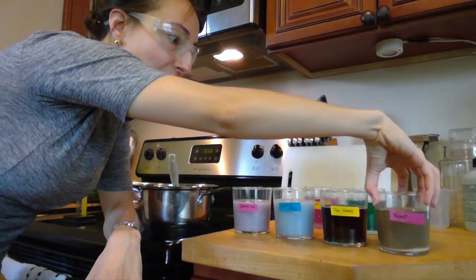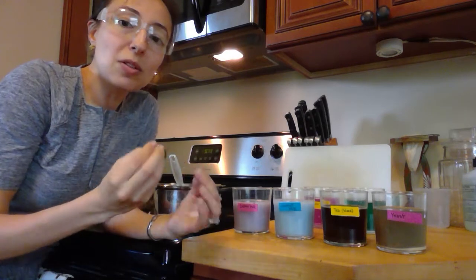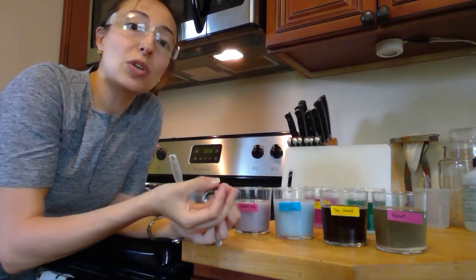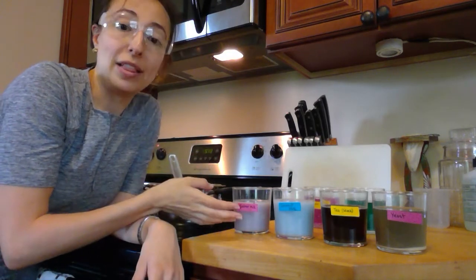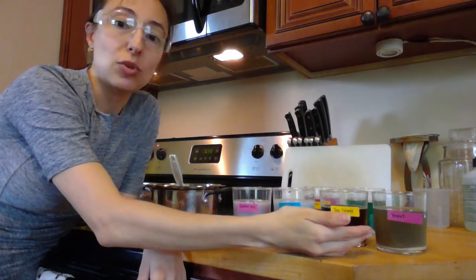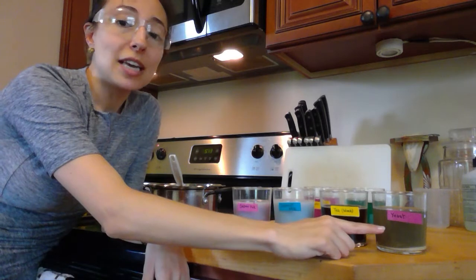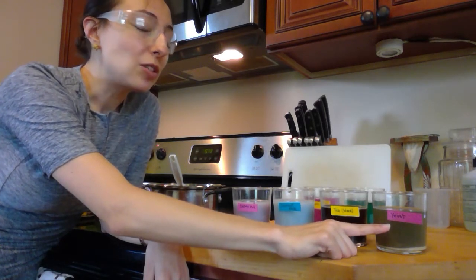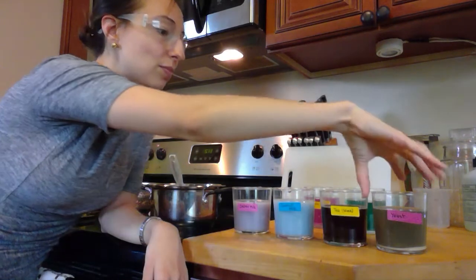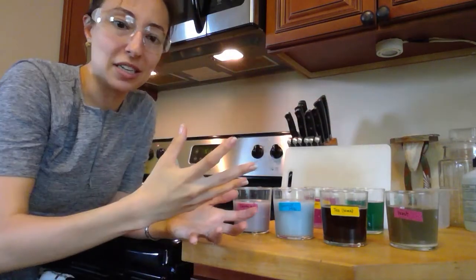Now it started out yellow, which means it's probably a blue. So that's going to be a little bit of the issue when you start testing out things with colors. Clear liquids will give you the easiest answer, or white liquids as well. You can see the difficulty if you test out liquids of different colors. It doesn't mean don't do it, but you might need to take in the color change from going from a yellow into a green. Probably means I added a blue to it, right? So this one is basic, but I can't really tell how basic.